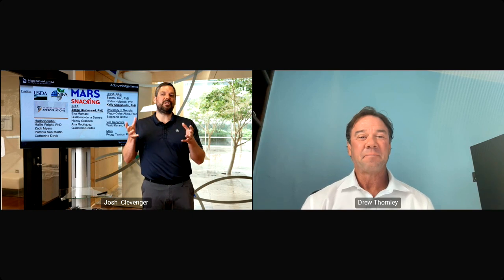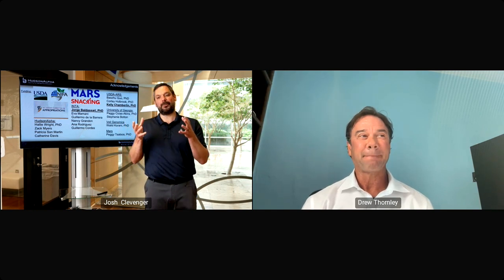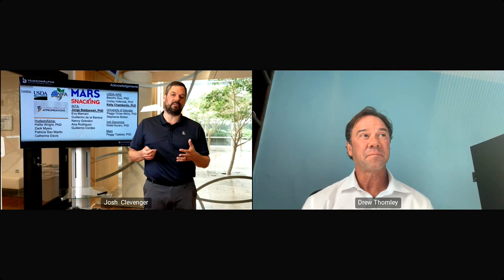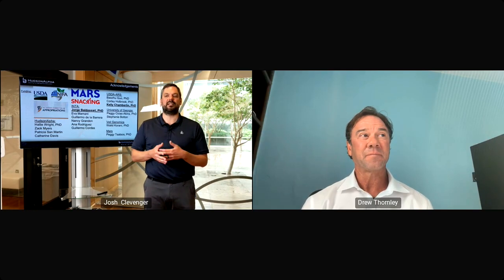And I always think back to that moment when I'm thinking about what you can do with a pangenome graph that's specific to your part of the world, and then layering on this incredibly accessible library prep, where you can do skim sequencing of thousands and thousands of individuals, and then use that in your genetics. I think it's really exciting.